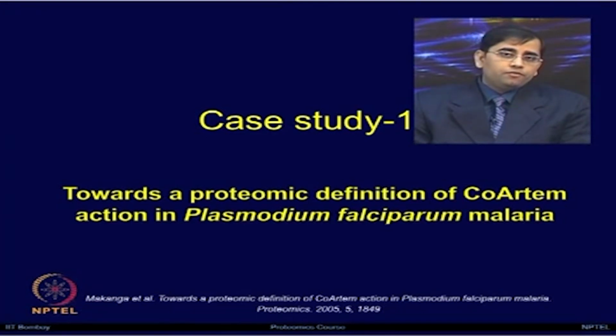Towards a proteomic definition of Coartem action in Plasmodium falciparum malaria, a study by Makanga et al. in 2005.